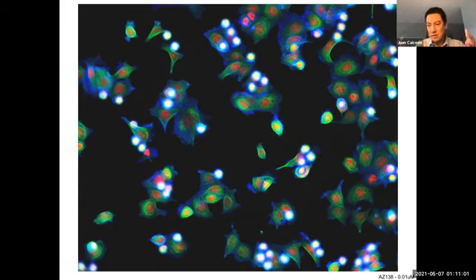In this case, it's not necessarily just the size, as in the previous example that I gave. There are many more features and many more characteristics of cells that are changing from one treatment to another. And for those cases, we need perhaps more information or better strategies for extracting information from those images.